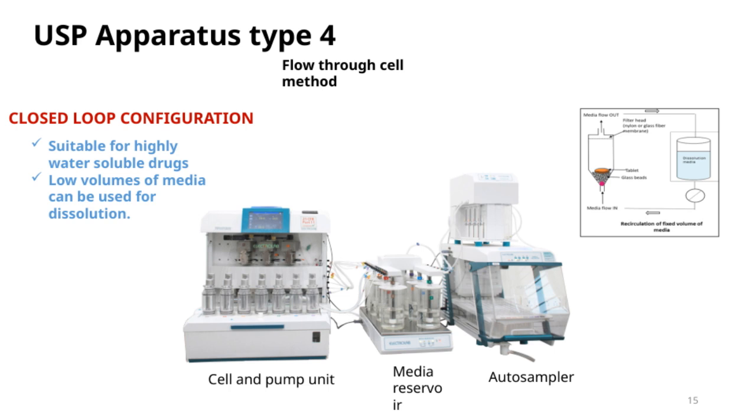Overall, the USP apparatus Type 4 offers a modern, efficient approach to dissolution testing, aligning well with the overall theme of improving accuracy and reproducibility in pharmaceutical analysis.